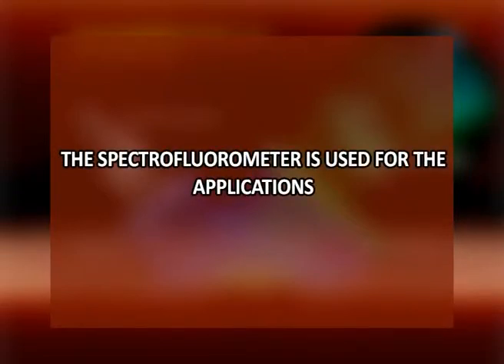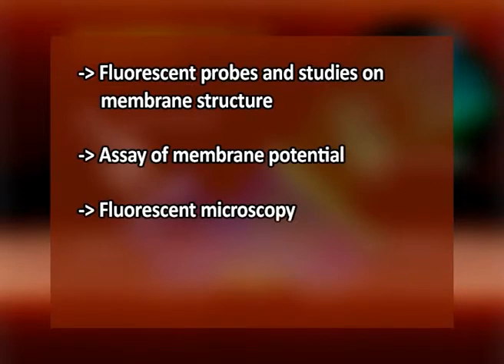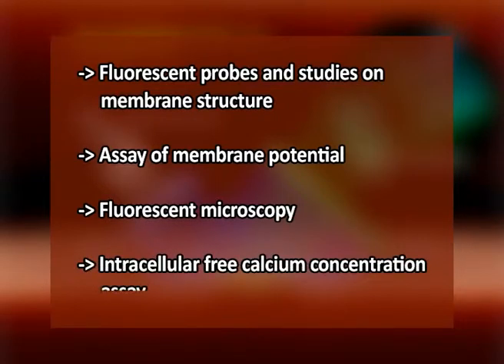The spectrofluorometer is used for applications like fluorescent probes and studies on membrane structure, assay of membrane potential, fluorescent microscopy, and intracellular free calcium concentration assay, in which the chelation gives rise to fluorescence whose magnitude is proportional to the free calcium ion concentration in the cytosol.